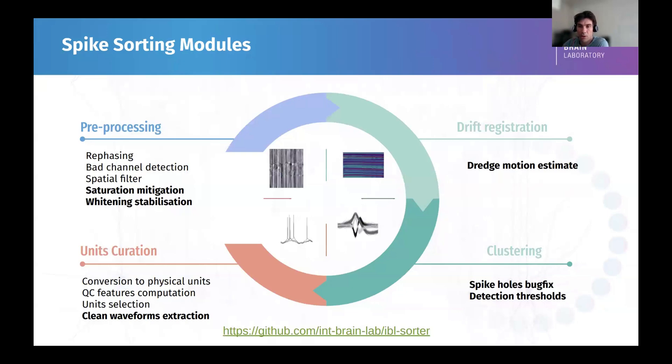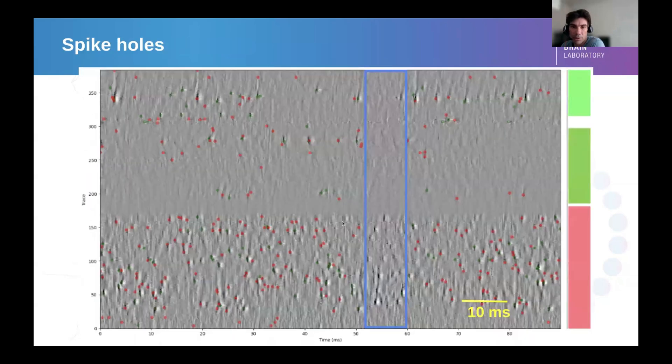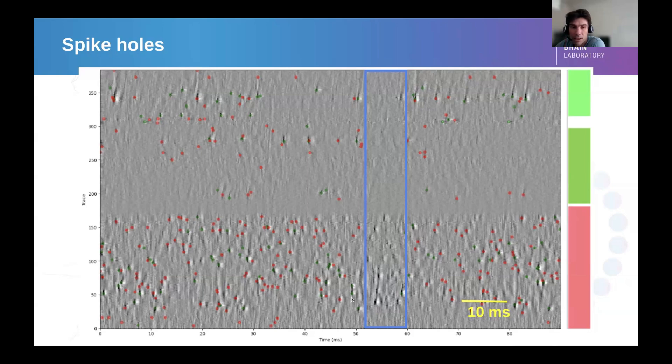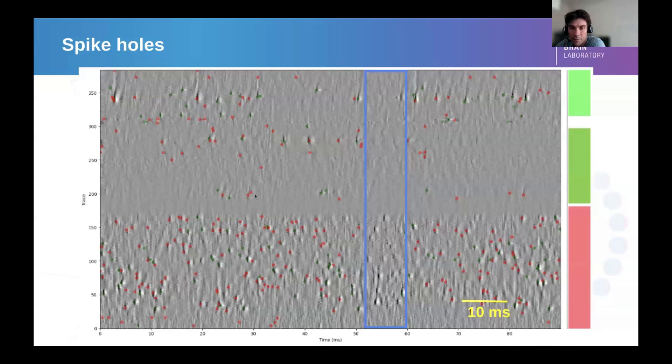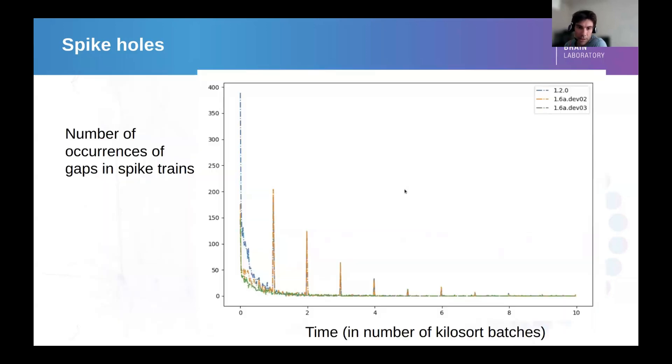I'm going to discuss a bit now clustering. So by looking at the raw data, and this is why I say it's important. Someone caught this at the IBL, but a bit later in the project, we start seeing that at regular intervals, we had a few minutes of missing data where there were no spike detection. So you can see all of the spikes are detected left and right, but not here. So when we started looking at the occurrence of those events, we tried to count the number of occurrence of those blank areas. And we saw that it was related to the batch length, to the Kilosort batch length.